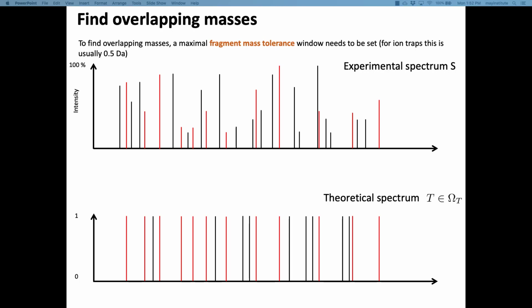By accident. Yeah? Because if you spread 200 peaks over 300 Dalton, then the odds of just hitting one of these peaks within the mass tolerance is not so small. Yeah, so you will have random matches, but these random matches will have a certain probability. And of course, if you have peptide peaks at the right position, and if it's the same thing, then you should maximize these odds of sharing peaks. And that is at the heart of many of these algorithms. You align these peaks.